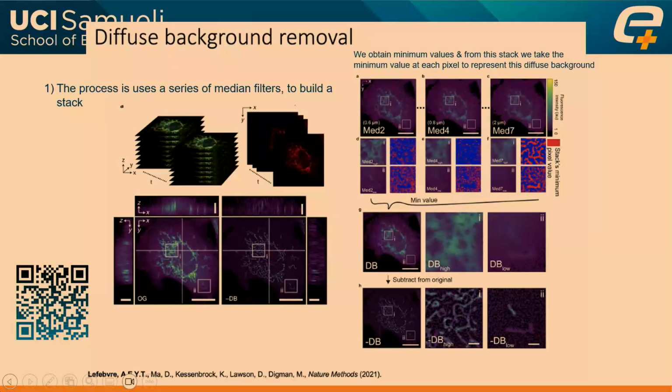We also automated the process for tracking the mitochondria in terms of looking at the mean square displacement and all of the other functions, undergoing fusion and fission events.